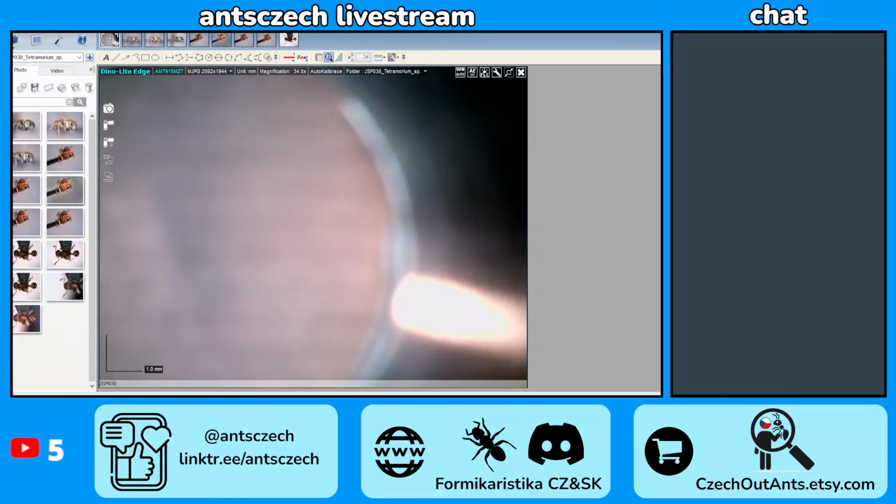I mean, it's a really cool idea. Ooh, there are some new scans. I think he did also some Tetramorium, right? It's possible. I will change the view.